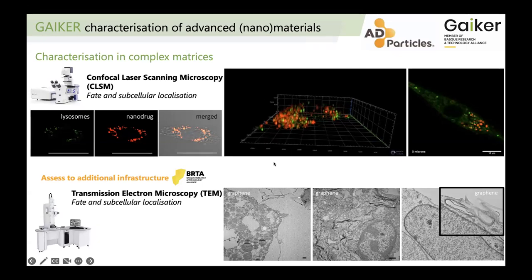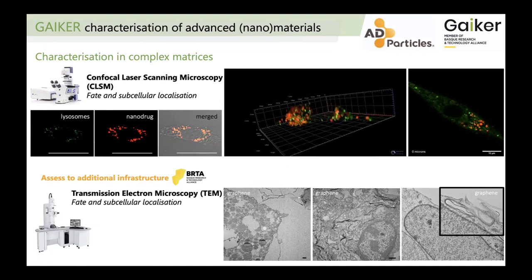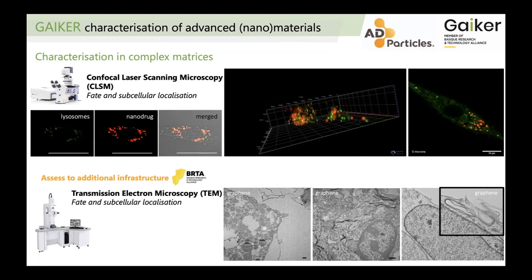So this is a video just showing a 3D image of a cell. So you can see that the nanodrug is internalized mainly in the lysosomes, but not exclusively in these lysosomes. And here, basically the same, but like in a z-scanning, showing basically the marking of the lysosomes and also the nanomaterials.